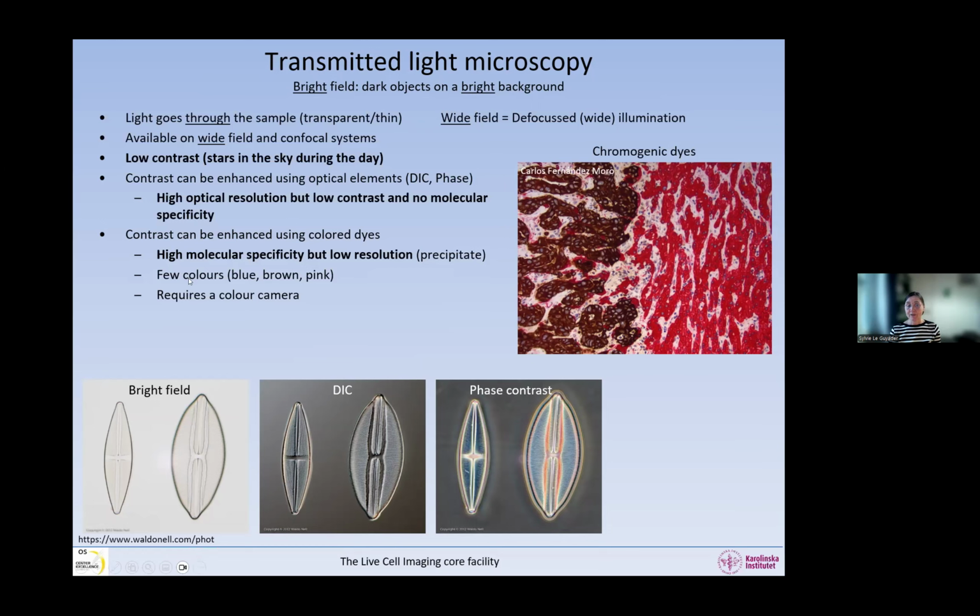And on top of that, you have very few colors to choose from, and sometimes it's difficult to differentiate the colors. And you require a color camera to image this type of samples. So they are not fluorescent. This is transmitted light imaging or bright field.